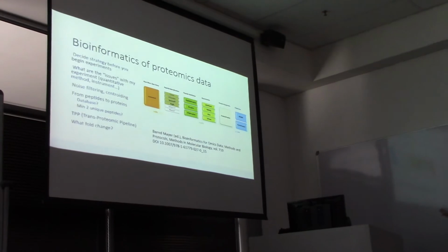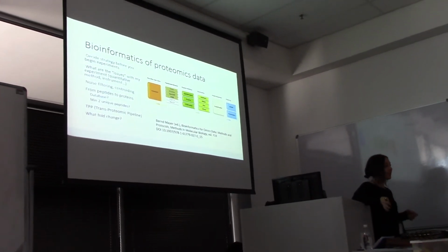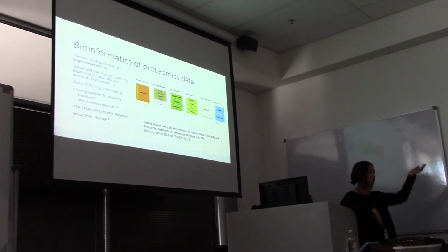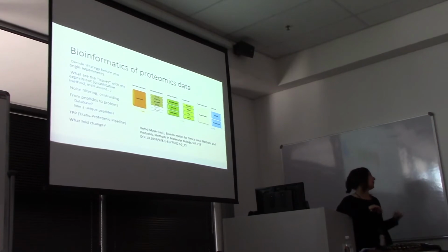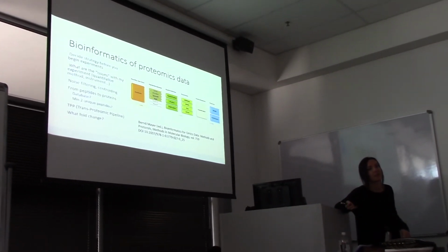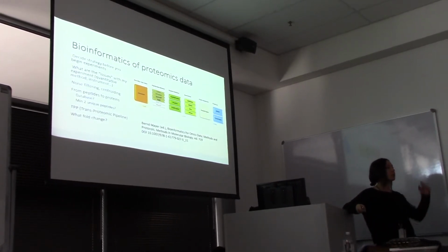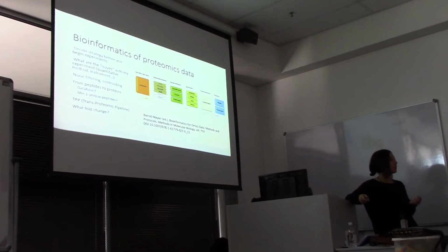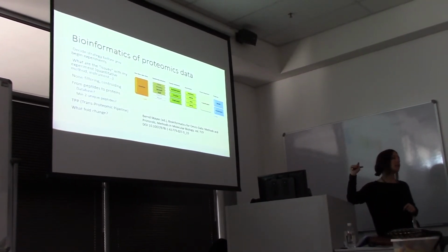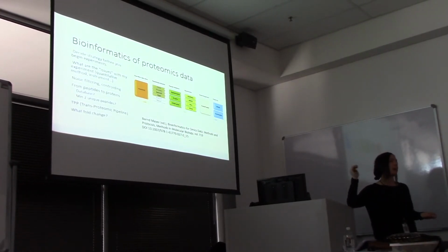I also put here what fold change. What is a significant fold change? And we talk about this all the time. A lot of people toss out anything that is not more than 2-fold. Or you have to look at, I'm only going to look at 10-fold fold change. But what is a biologically significant fold change? I don't know. I don't actually have that answer, because sometimes there are minute differences that you can detect in a cell that are biologically significant, but we end up tossing out anything that isn't more than 2-fold change. Is that a mistake? I don't know.